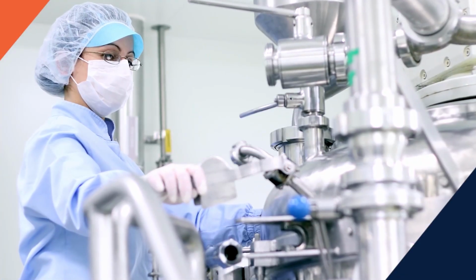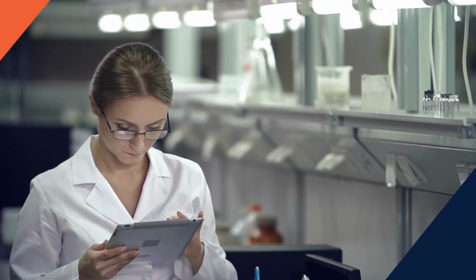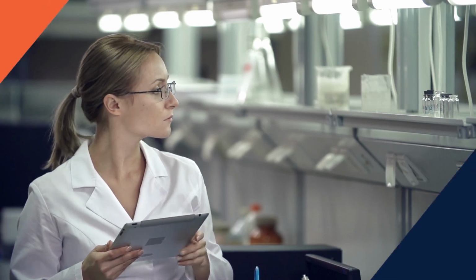The first stage is you have to change the data that the instrumentation is giving you into information. Now you do this by using MVA software packages, because the MVA software packages can find the latent variables within your data to change that data into information. We use DOE software to give us the maximum amount of data from the minimum number of experiments, because we want to minimize the number of experiments. Experiments cost time, they cost raw materials, so you want the minimum number of experiments.